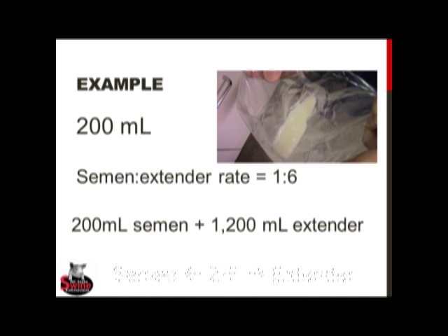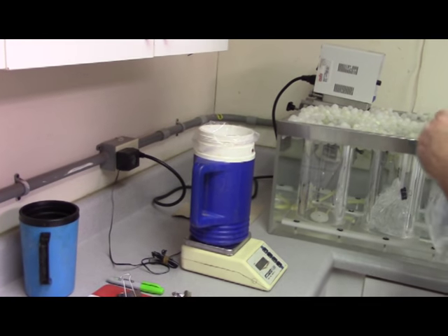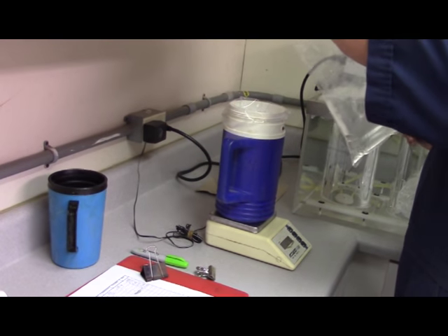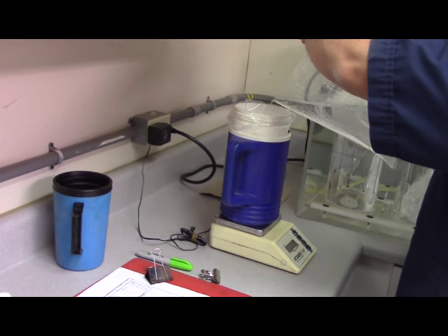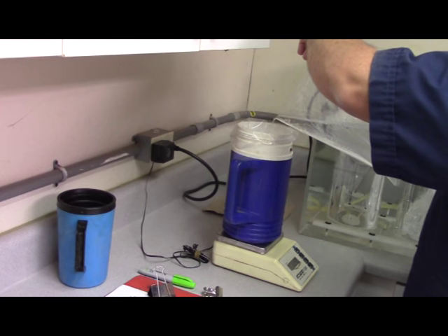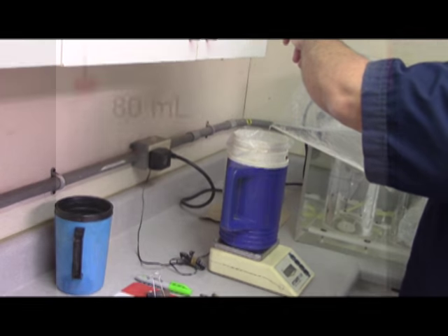Before adding the extender, we need to make sure that the extender and semen are within 2 degrees of each other. We can usually accomplish this by removing the extender from the heat source and allowing it to cool. Once we have the temperatures where they need to be, we can add the extender to the semen. Always add the extender to the semen rather than the other way around, and don't mix all 1200 milliliters all at once. Instead, add about 1/3 of the total volume by slowly pouring the extender down the side of the semen bag. So in this case, we'll add 400 milliliters, then gently mix and repeat until all extender is added and completely mixed. We should now have a total volume of 1400 milliliters of extended semen.